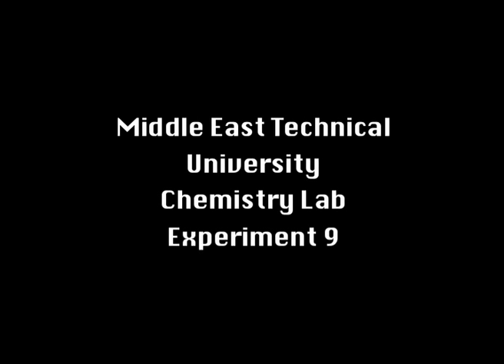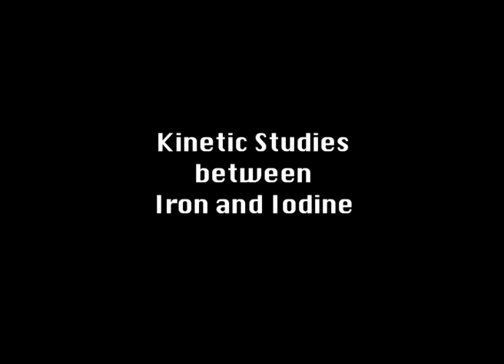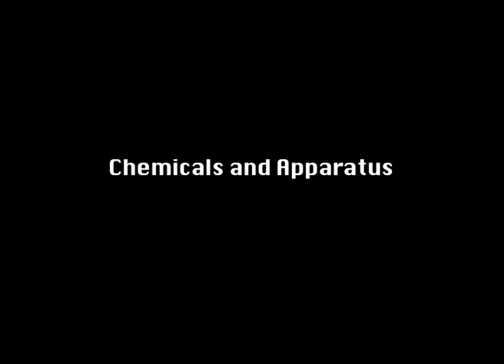Experiment 9: kinetic studies between iron and iodine. Chemicals and apparatus.